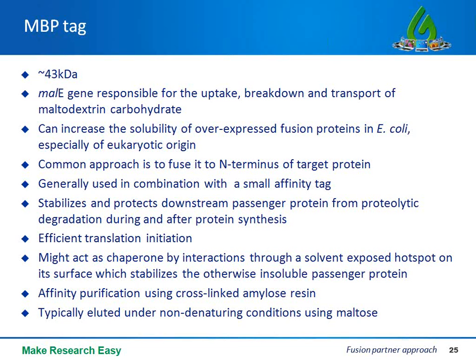Now cytoplasmic yields of MBP fused proteins are also usually higher because the fusion protein provides reliable contexts for efficient translation initiation, and it's also proposed that the MBP tag might act as a chaperone by interacting with solvent exposed hotspots on the target surface, which stabilizes the otherwise insoluble passenger protein. Now commercial vectors for MBP tagging with a variety of cleavage sites are available, both for cytoplasmic and periplasmic expression.